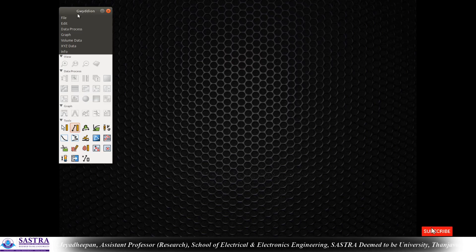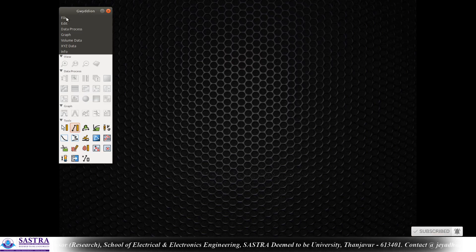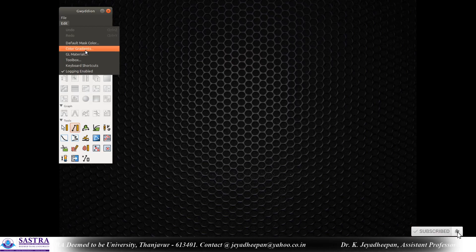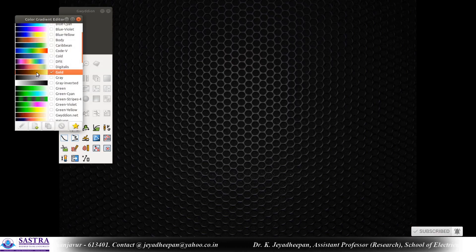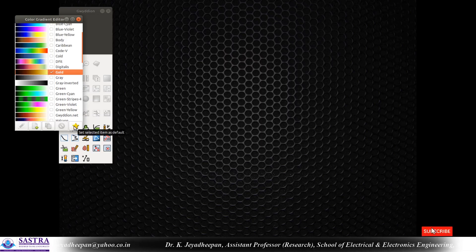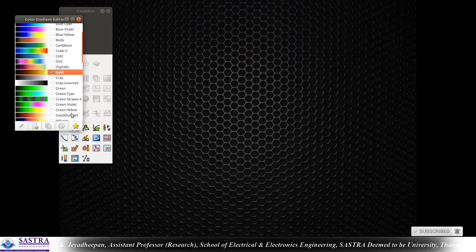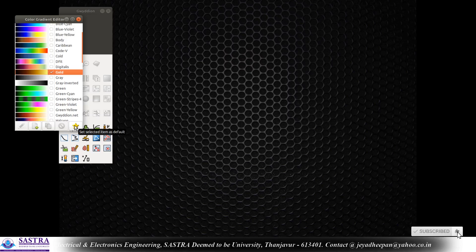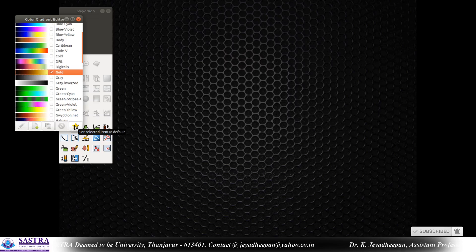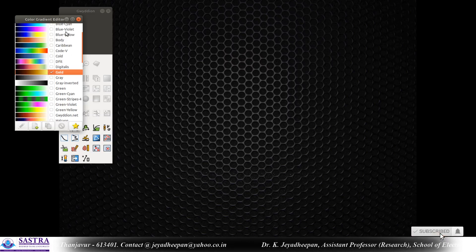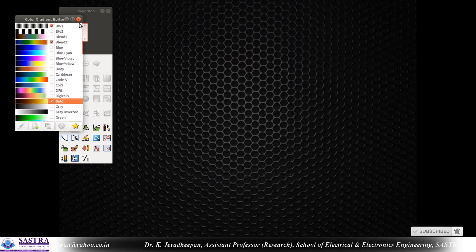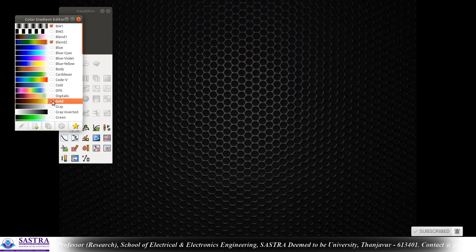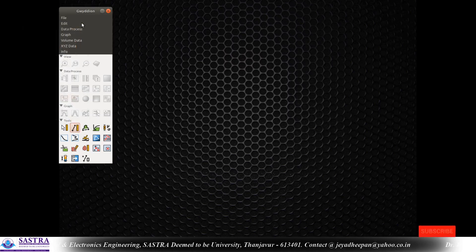First you have to open the Gwyddion software. Once you open it, the first thing to do is go to color gradients and select gold as the default color. Just put a tick mark in front of gold and press the star button, so that the selected gold color will be set as default for all opened images. Otherwise the images will be in grayscale, so I insist you select this gold color as the default.